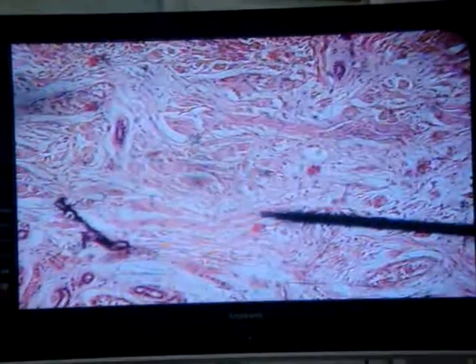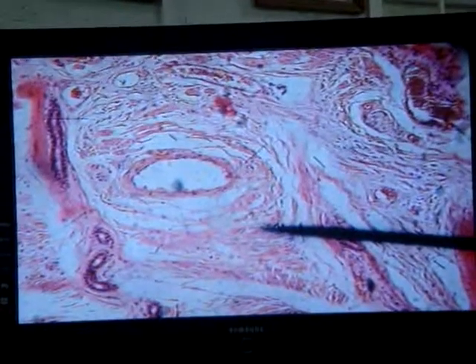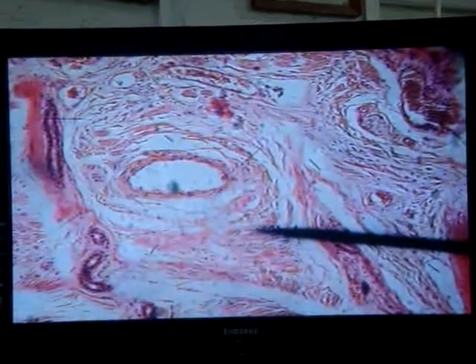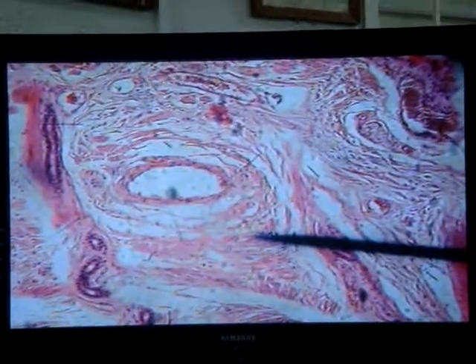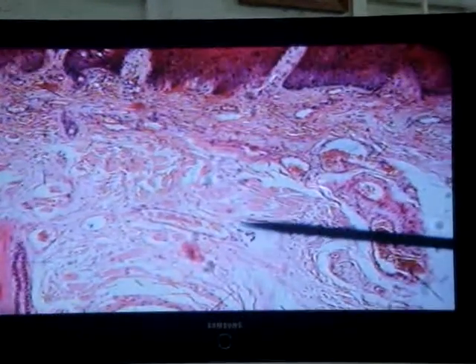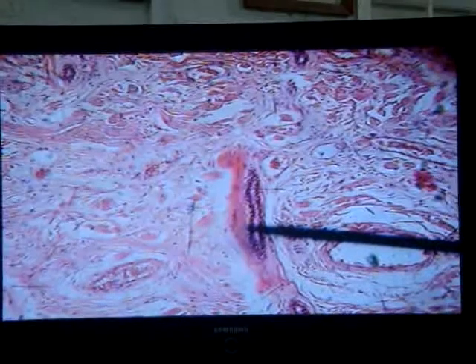So that's the dermis. This dermis, in addition to having the collagen fiber, and by the way, the dermis also, as you know, is very elastic. So the dermis also contains elastic fibers, some reticular fibers and so on. So not just collagen fibers are there. But as you can see, the dermis also has a number of little blood vessels, some nerves, and a wide variety of cells.